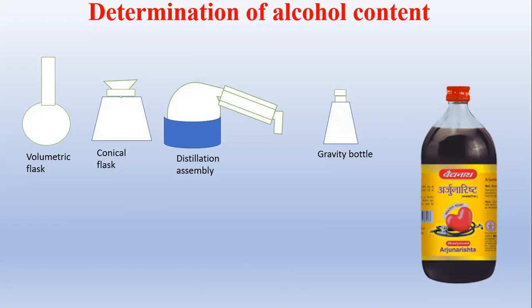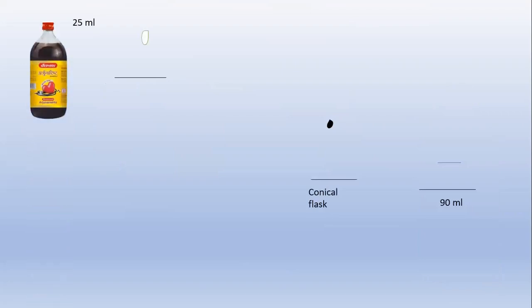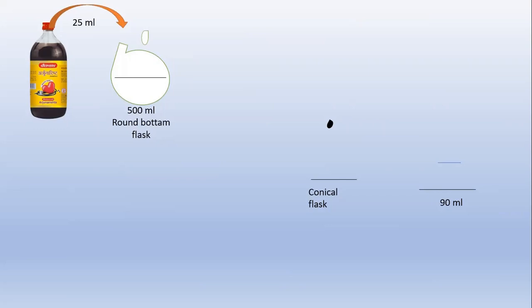Now let's start. First we take the Arjuna Arista bottle. To the round-bottom flask, which is a part of the distillation assembly, we add 25 ml of the preparation — that is Arjuna Arista. Then we add water up to 150 ml to this mixture.